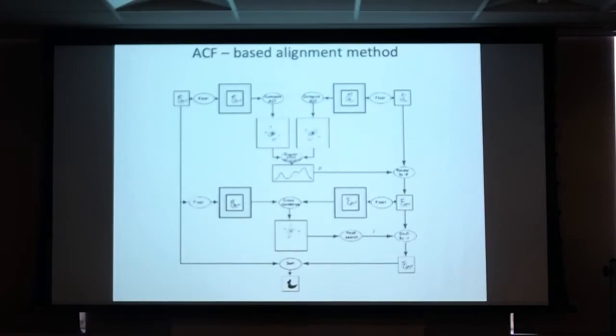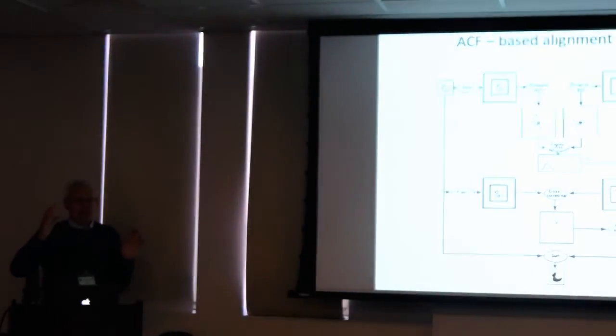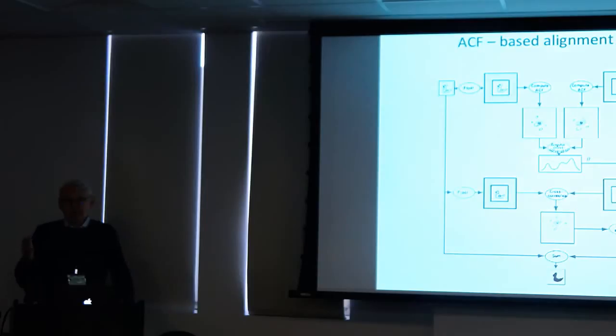Well, use of GPUs really implies that you have canned programs, which is a sharp distinction from the whole idea of SPIDER. SPIDER was a modular program which allowed you to put a workbench together. Any ideas of image processing you can translate into a sequence of commands, and can try out what comes out. And nowadays we have highly canned black box programs, which are highly efficient, but they don't provide you the conceptual insight into what is going on. And I sort of deplore the demise of the modular programs. And I like to keep them alive.